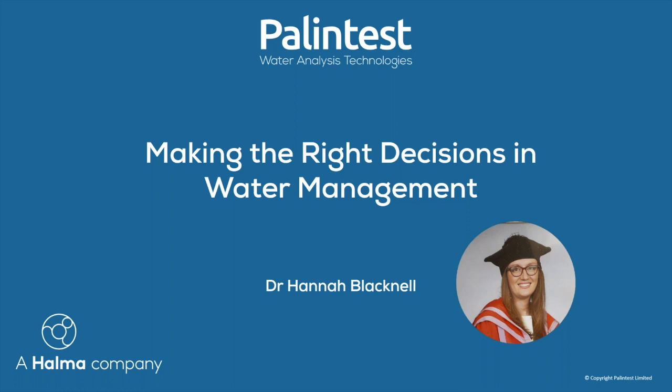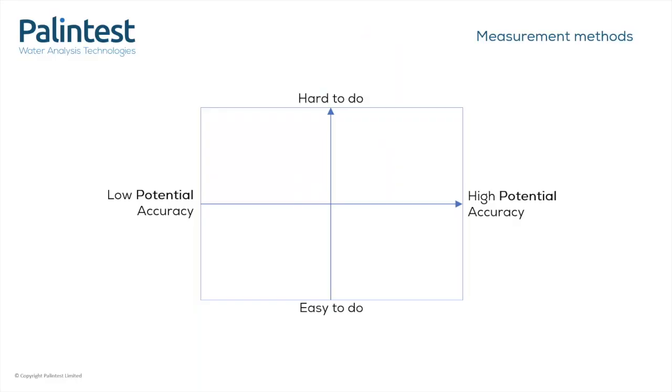Now, based on what I've said just there, I want to be able to apply that knowledge into real life situations that we encounter in the water industry. Understanding precision and accuracy clearly can help to ensure that we make the right decisions when it comes to adjusting the treatment of water or interpreting the results of our water testing. So the first decision is what kind of method is best for you.